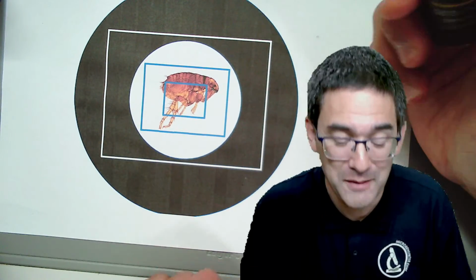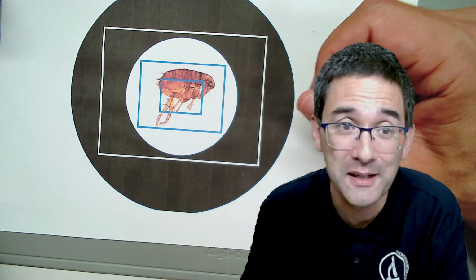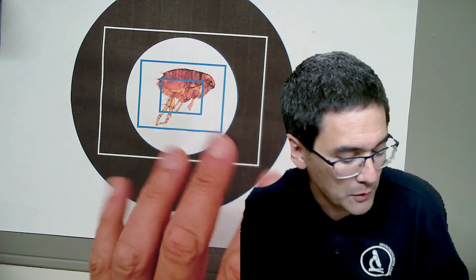So essentially, if you have a camera with a large field of view, it would be nice to also have plan objectives which are in focus all the way to the edge. So this is basically what field of view means, and that's something that we always have to keep a little bit in the back of our head.